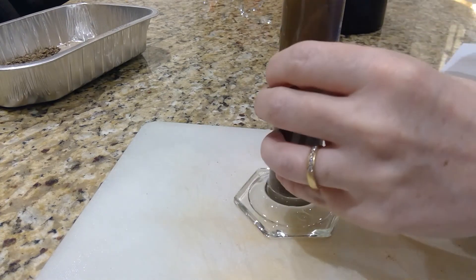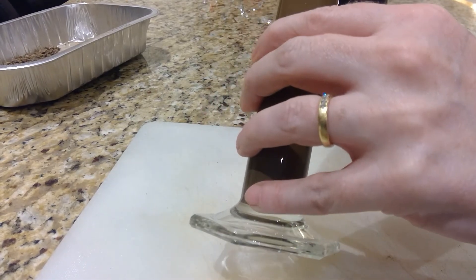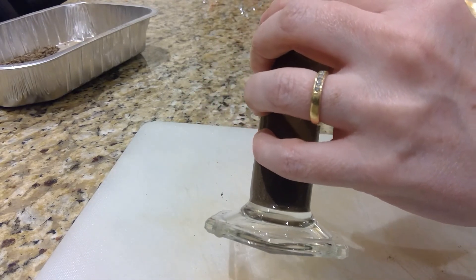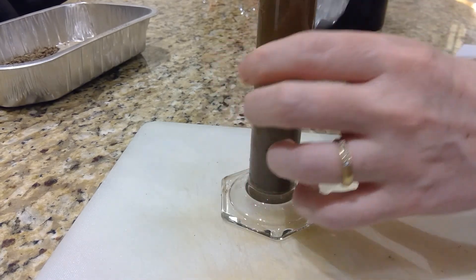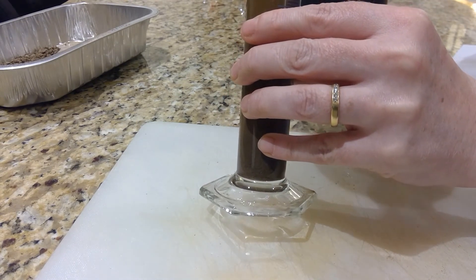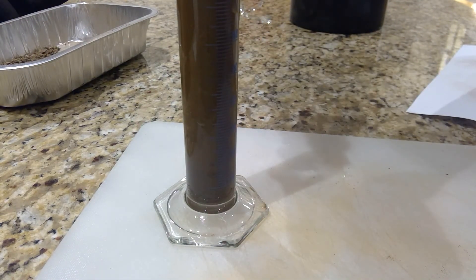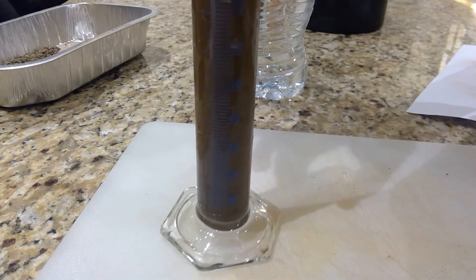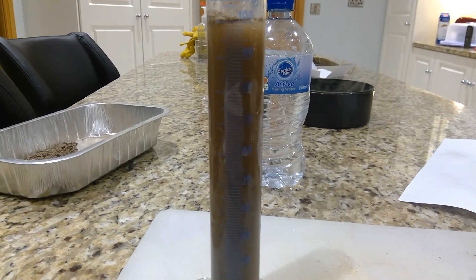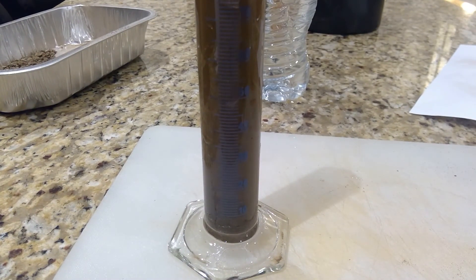I'm just washing down the sides now, and then I'm going to leave it overnight. The water level is up to the 100 mark, as you can see. I'm going to leave it overnight and let that settle, and then I'm going to read my results. Thanks a lot.